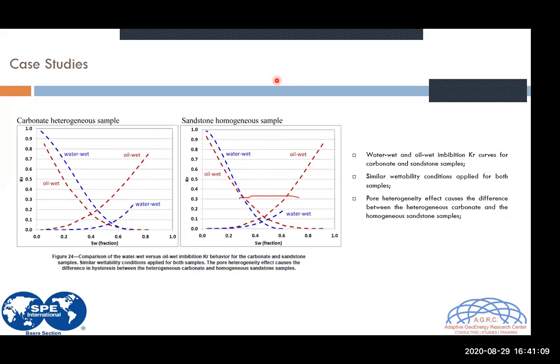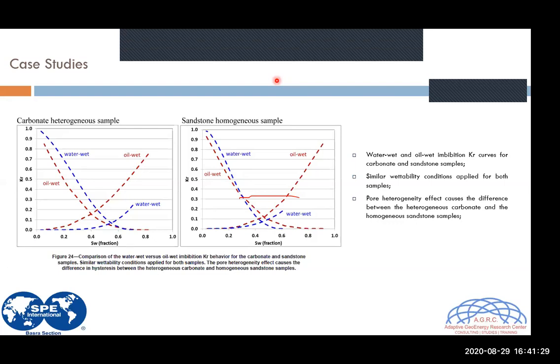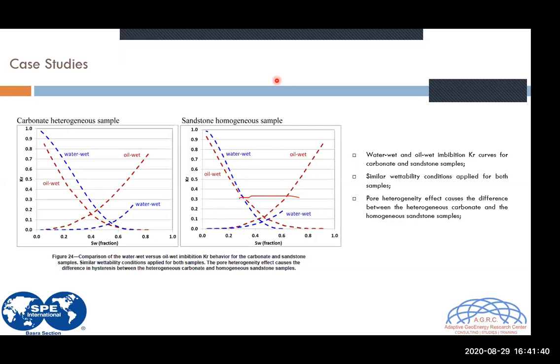Okay, so it was interesting because we started with the larger scale, with a whole core. You perform this evaluation until you reach a higher resolution 3D model. You can perform several simulations or several post-processing analyses there. Then you can move on again to larger scales, incorporating this information, the trends that you can generate from the relation between the several parameters.